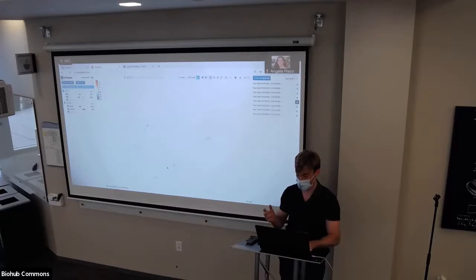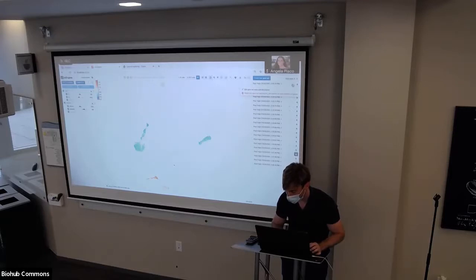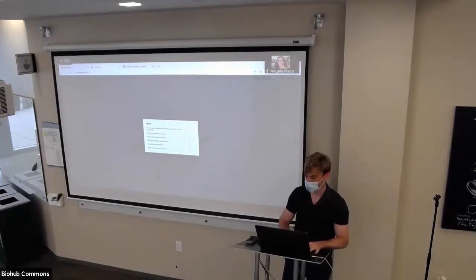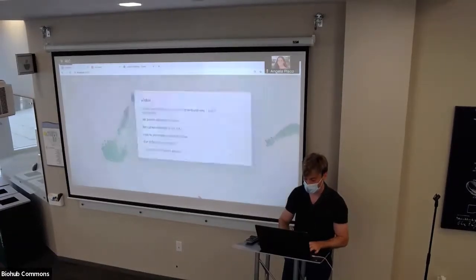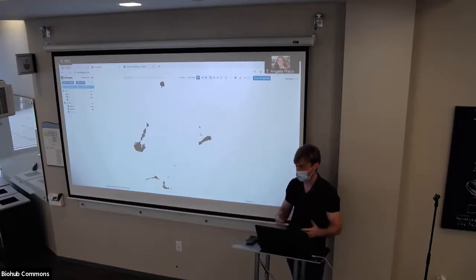Let's say I'm going to make a bunch of gene sets on the right. With a big data set of hundreds of cell types, you're going to have a lot of gene sets come up, because you have 2 per marker gene identification, one high, one low. The only way to delete them without hotkeys is to hover over these 3 dots next to the droplet and then click delete this gene set. Hover, delete, hover, delete. For hundreds of gene sets, it's kind of annoying to do that. So the other hotkey is Shift Q: delete the most recent gene set. This deletes the gene set on the top, and you can quickly spam Shift Q until it's gone. So this is also quite nice to clean up your interface.